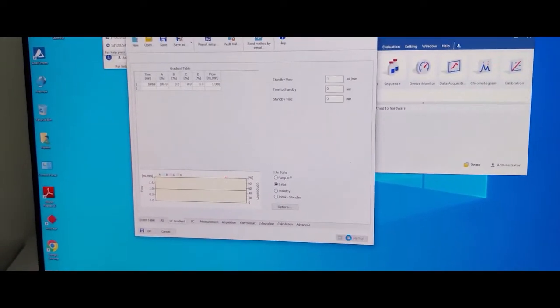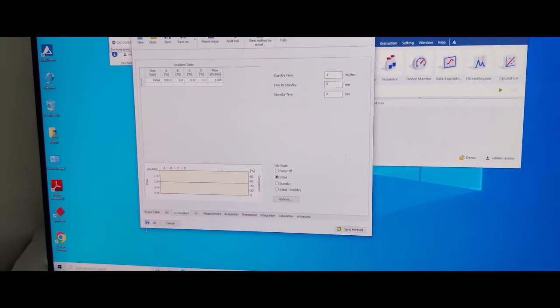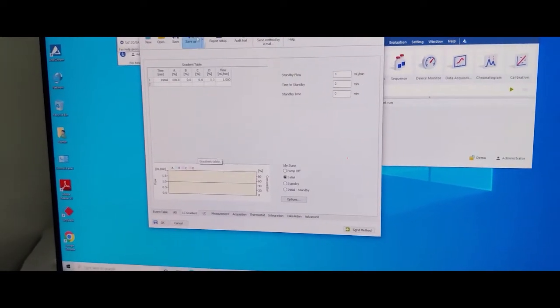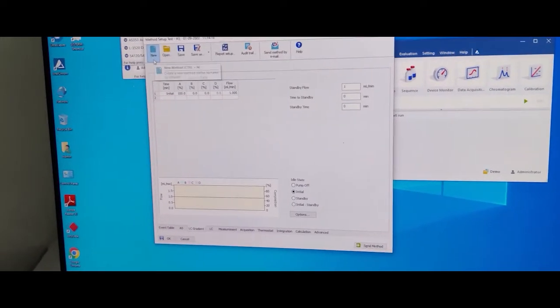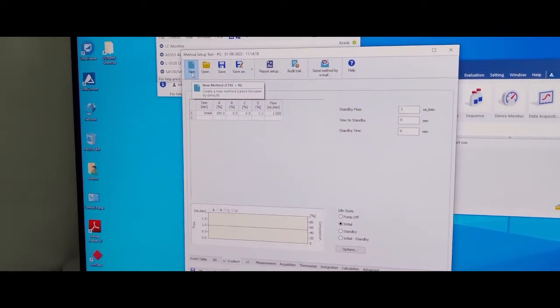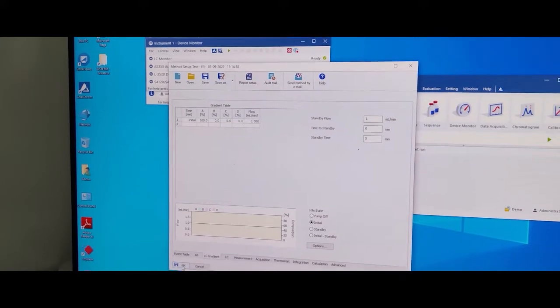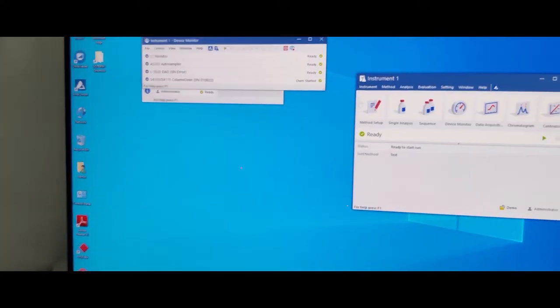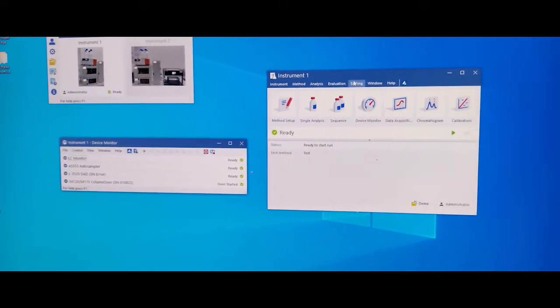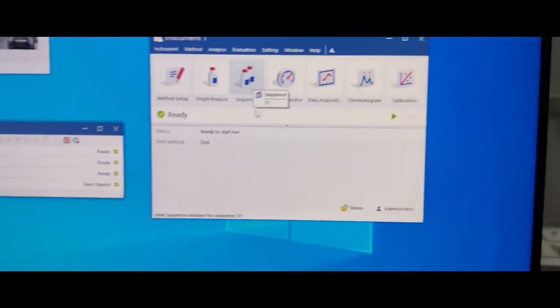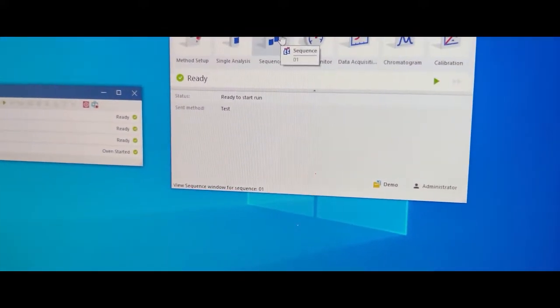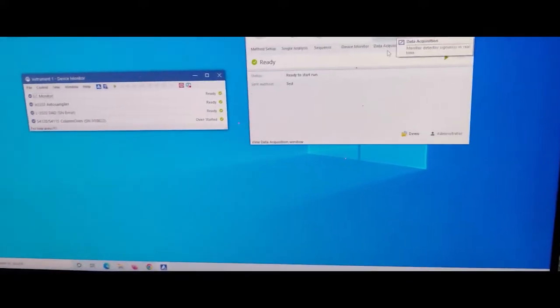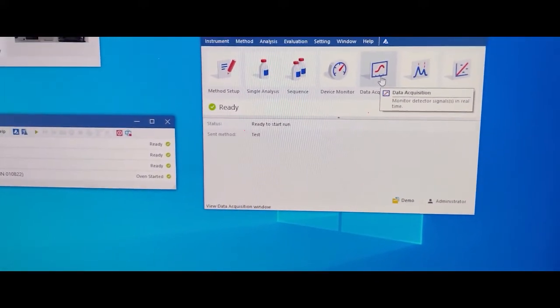Send method. If you want to make a new method, click here. Now the method is set up. OK, click.